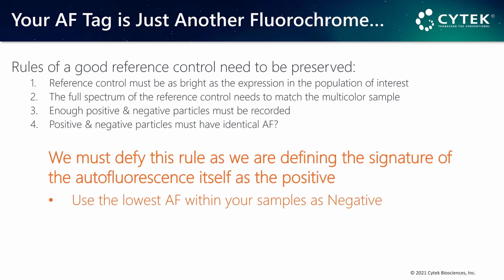We need to redefine this rule because now we are defining the signature of the autofluorescence as our positive, and therefore we need to identify and use the lowest autofluorescence present within the sample, and this now becomes our negative.